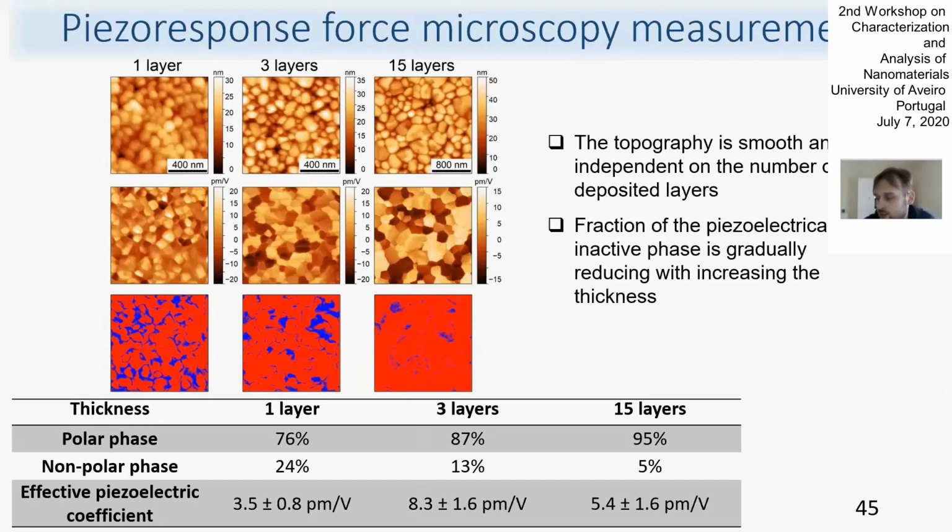In our specific research, we demonstrated that the phase content extracted from X-ray diffraction and piezo response force microscopy is very, very similar. So this method is highly interesting for measuring the phase distributions in ferroelectric materials, for example.